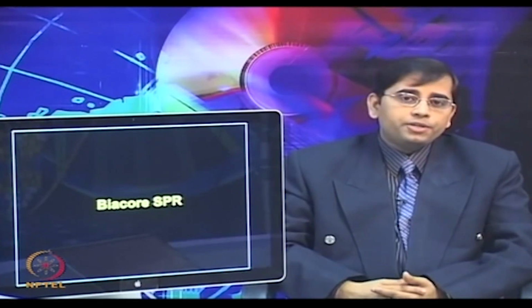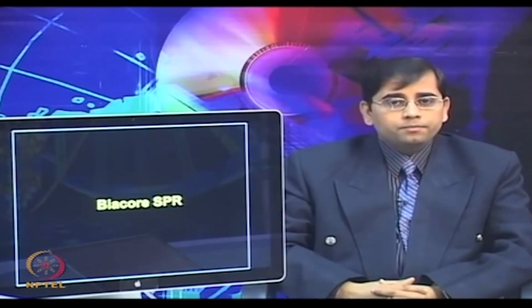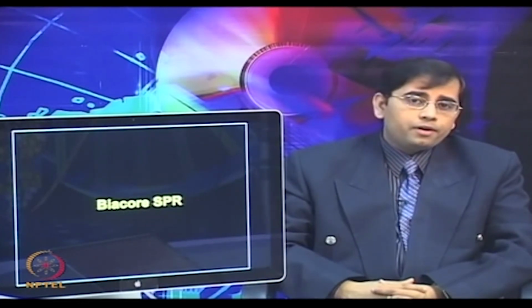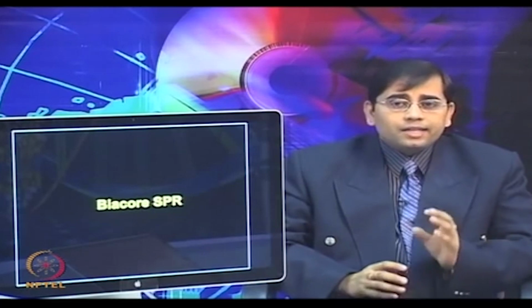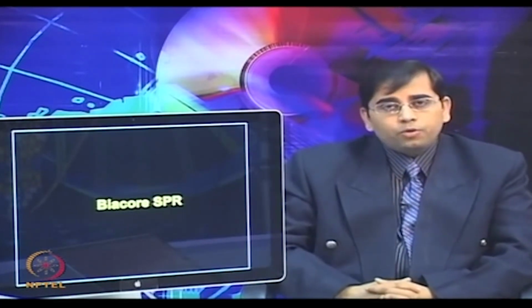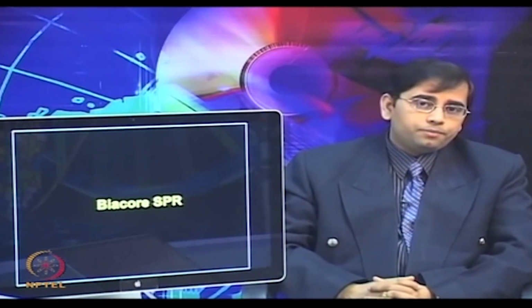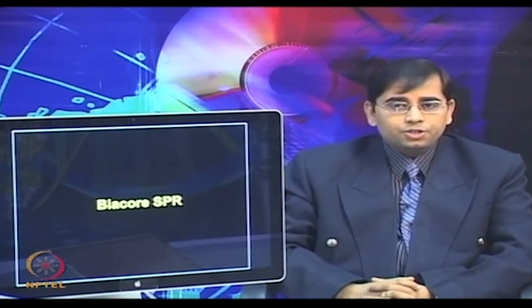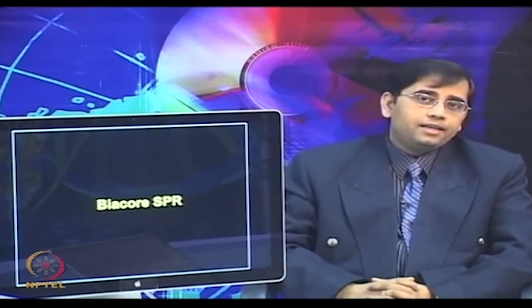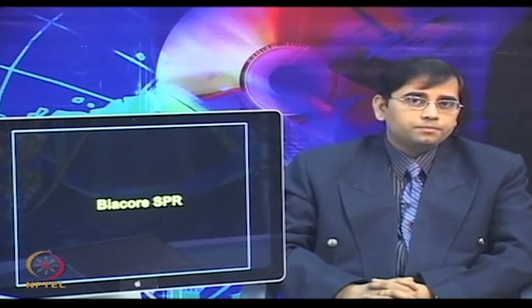A number of commercial SPR biosensor instruments are available. Since then, however, the Biacore system still dominates this field. So, let us now discuss the Biacore technology with Lalit Kishore, the business leader research products in GE Healthcare Life Sciences, who handles the Biacore system.